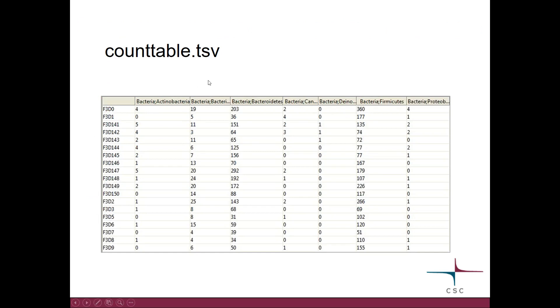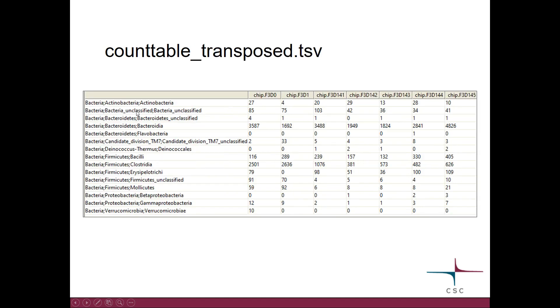The resulting count table file looks like this — here you have the samples, here you have the species, and then the counts for each species in each sample. The transposed table has exactly the same content, but has been tilted so that now you have the samples as columns.